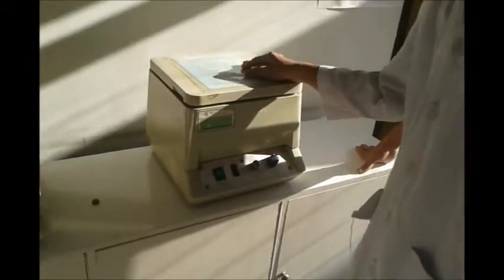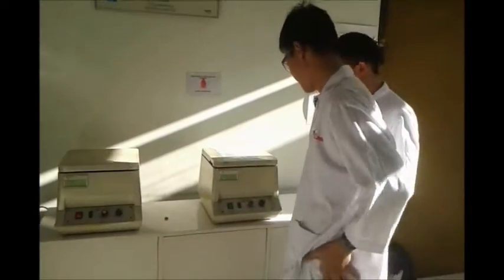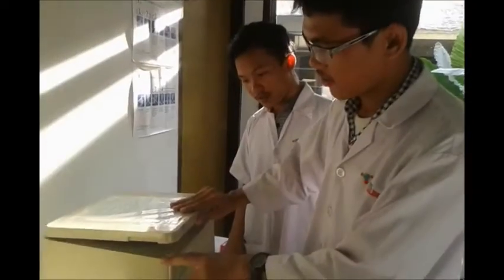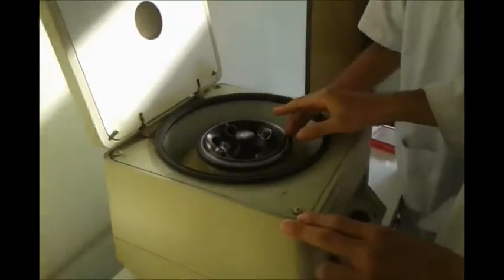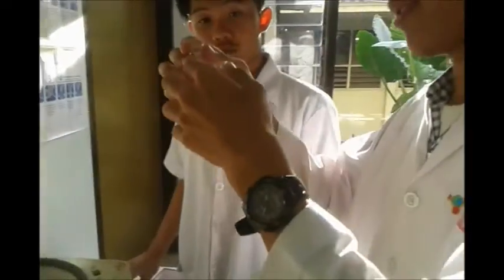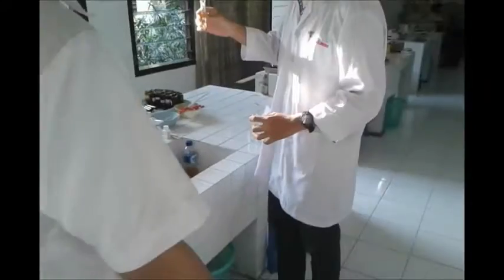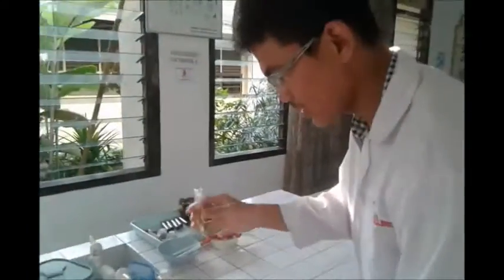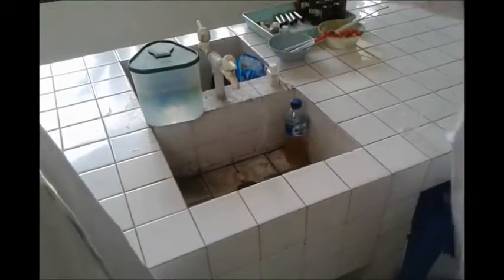Okay, we wait until the centrifuge stops. We go to the next step. Okay, take this. And the next step is we must pour the supernatant rapidly, like this. This is a sediment urine.